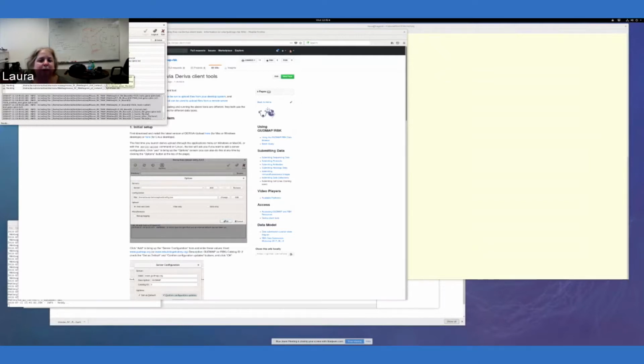numbers. And again, what this client tool is going to do is query the database and make sure that there is a place in the database to attach this file to that corresponds to the encoded file name. So when I click upload, this is going to work for all except 2 that I have deliberately misspelled.